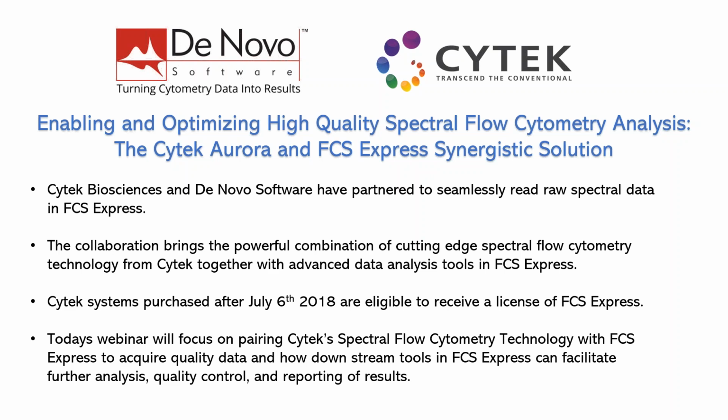On today's webinar, we're going to focus on pairing Cytek spectral flow cytometry technology with FCS Express to acquire quality data and how downstream tools in FCS Express can facilitate further analysis, quality control, and reporting of those results.